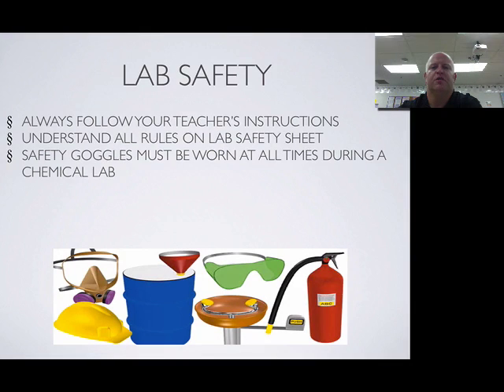Okay guys, here's a real quick version of our lab safety notes. If you are in class, then you do not need to watch this. However, if you're out of class, you need to see this for our lab safety portion. So this is our lab safety video, or we could have the in-class lab safety notes also. Please make sure you follow my instructions at all times. If you do that, for the most part, everything will be safe.